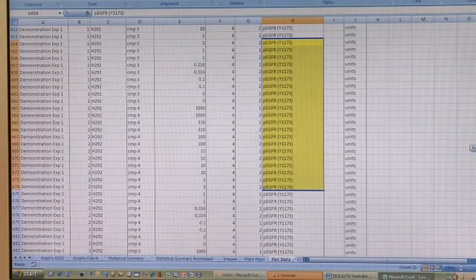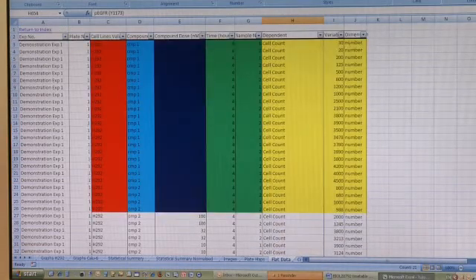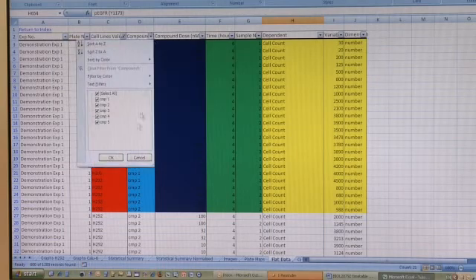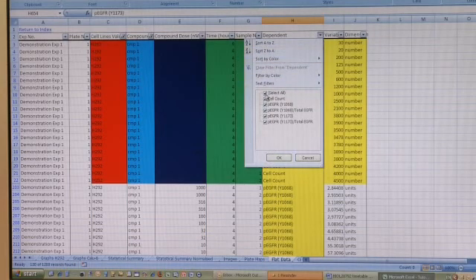Data in this format can easily be imported into most statistical packages. Likewise, one can apply filters at the top of the data to select subsets. For example, H292, compound 1, and cell count filters can be set, as shown.